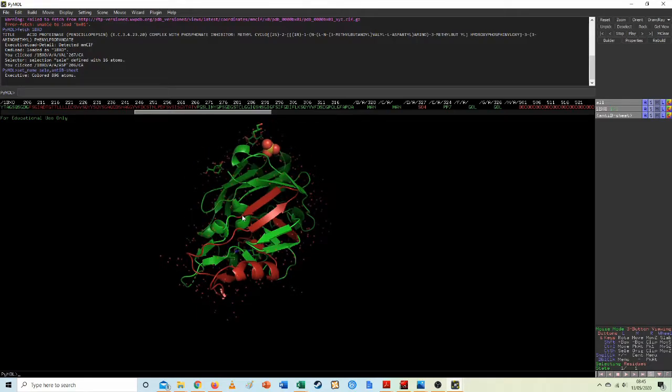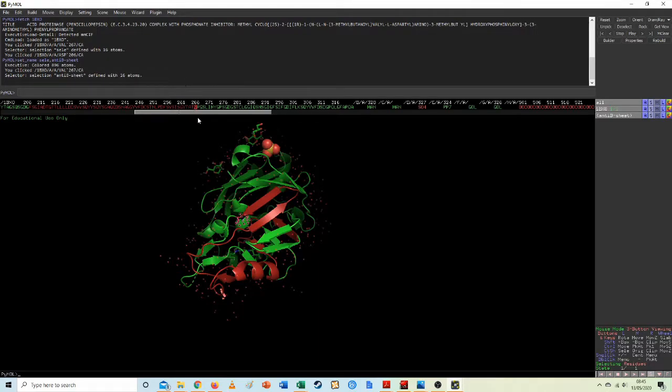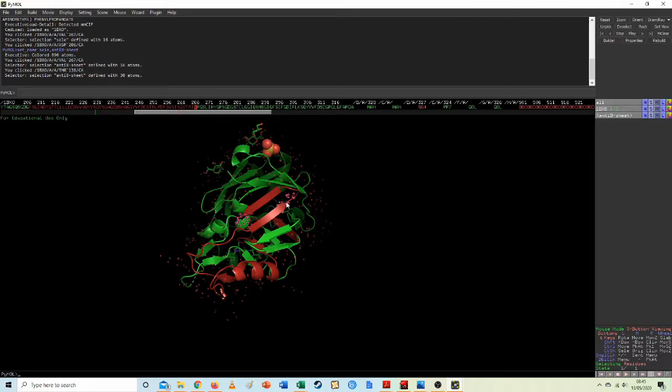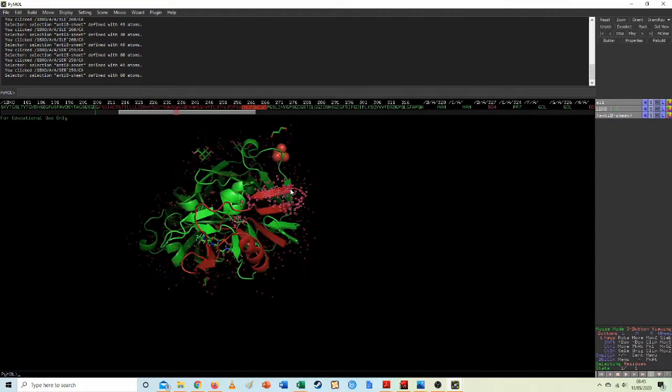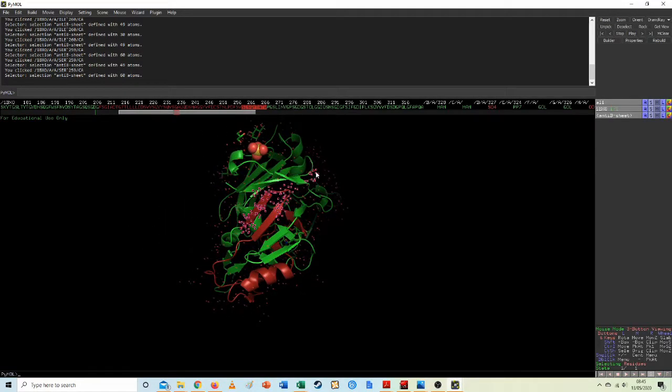And what I might do is take a look at, so that's this one, and this one is, where are you? Here we go. What I want to do is just pick on all of these ones here. I want to deselect that one. No, no, deselect, nope, nope, oh dear.